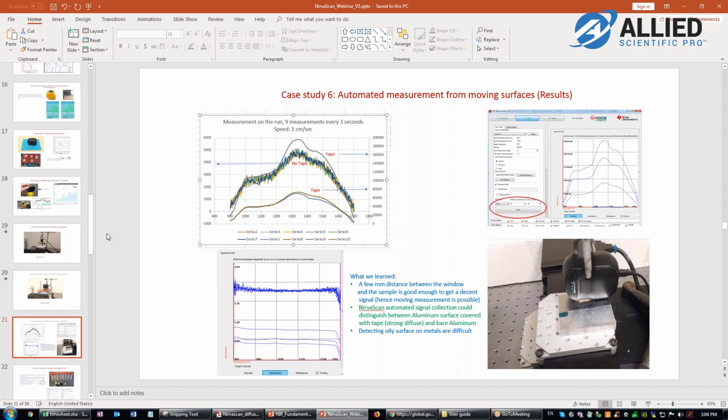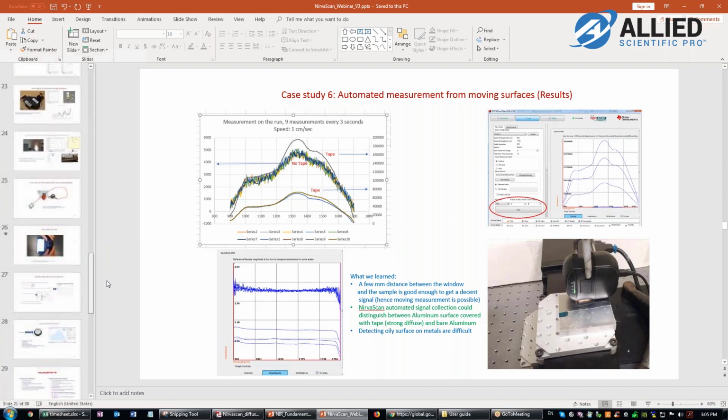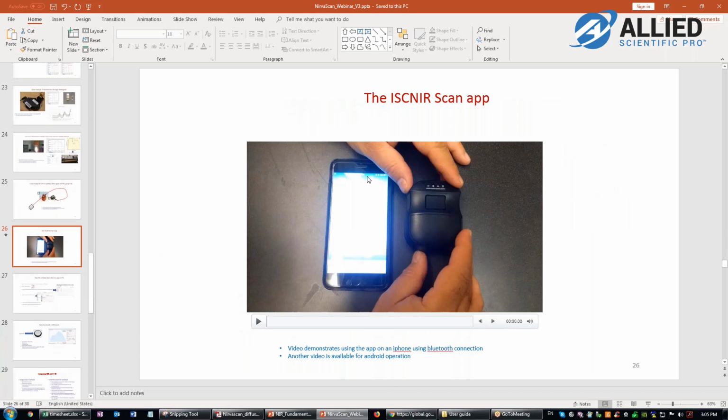In order for me to, let's say I have a surface of the pavement, I normally can take a portable device and point it on the surface and get a signal. Can I take your device to the pavement and do that, rather than drilling, which becomes destructive? You see what I'm saying? Yes, absolutely. Non-destructive, I want to take the instrument and point it to the surface. Yes, you can do that, definitely, because as I showed you here, this is the app that does that.